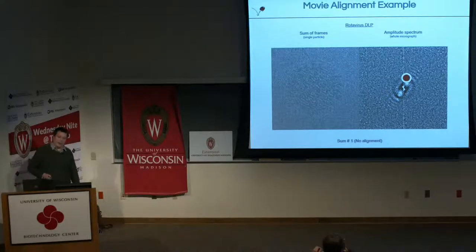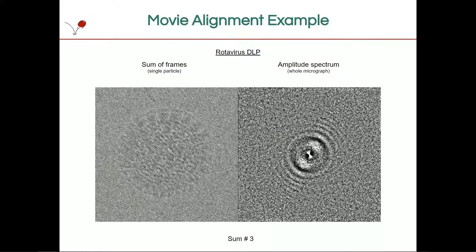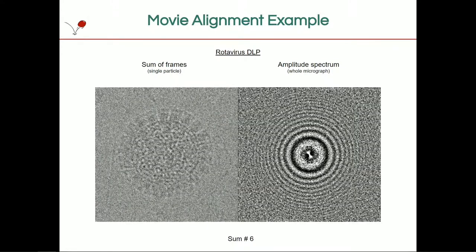It's been blurred out. And so you see, if we just run this refinement after three rounds, I can flip backwards and forwards maybe. It's hard to see on this screen, but on the left we see some sharpening up of the virus. But you can also see that we start to see more and more rings. The rings start to fill in. And if we go sort of six rounds, now we've really recovered essentially all of the information lost due to the motion in this image. So you have these nice circular rings. They go all the way to the edge. So now we've recovered a lot of high-resolution information in these images, and we essentially end up with much better reconstructions as a result.